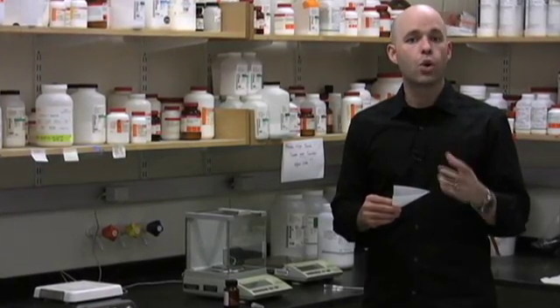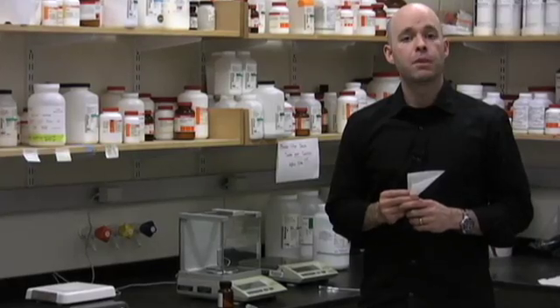So in the end, when weighing out very small amounts of material, you want to avoid heavy large flasks or cork rings and you want to go with a light weigh paper. This will give you a much more accurate reading.